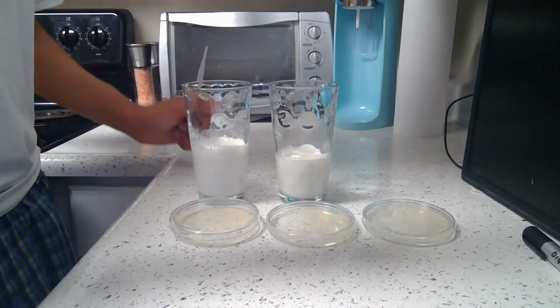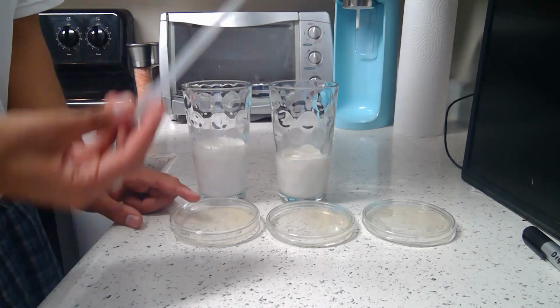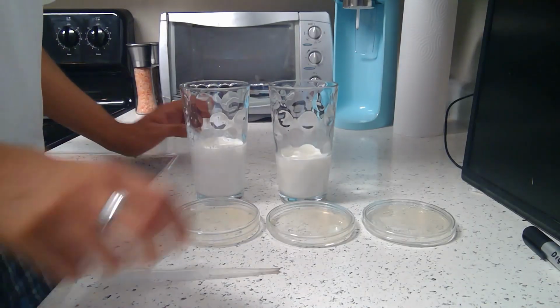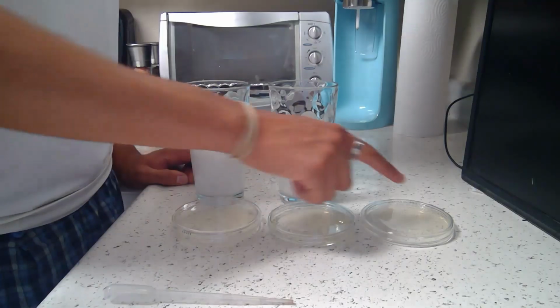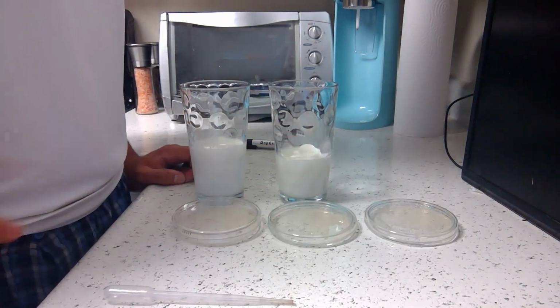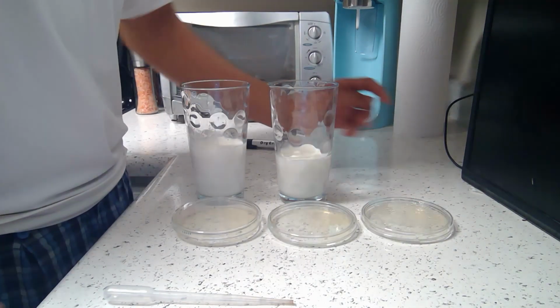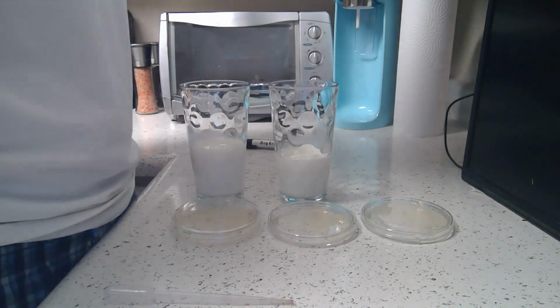So I will pick a little bit of milk up, put it in there. I would like to say that I will not add a lot of milk because I do not want the possibility of mold growing from the moisture. After each use, I will mark each dish appropriately. On the first dish, I will add nothing, as I said earlier. This will be our first control dish. That way we can see what kind of bacteria will grow due to lack of sanitation, lack of proper and further sanitation that I was unable to perform at home.